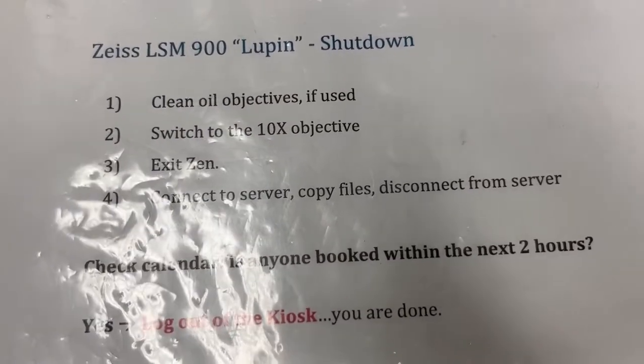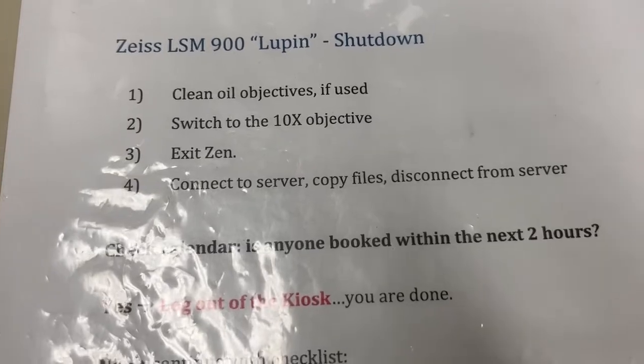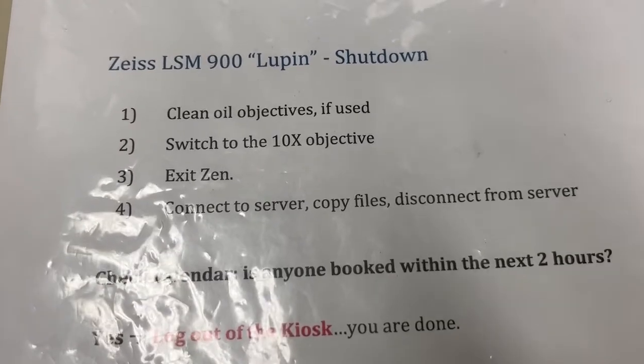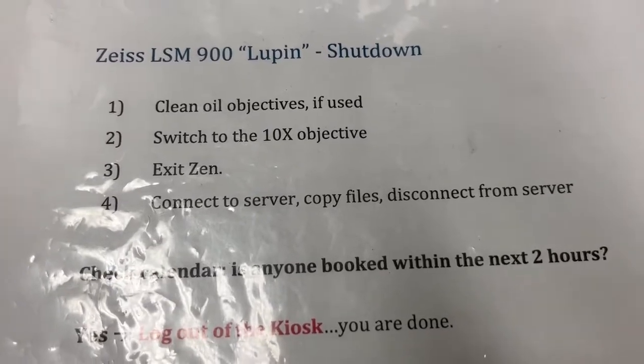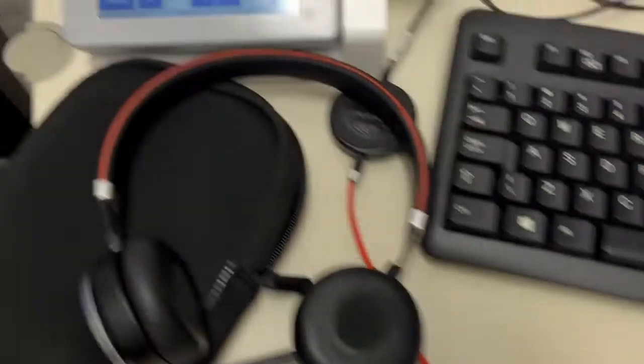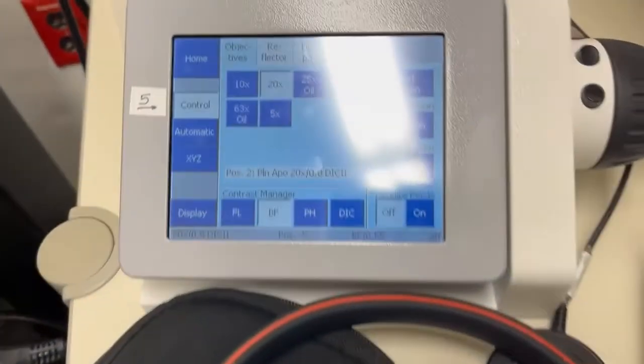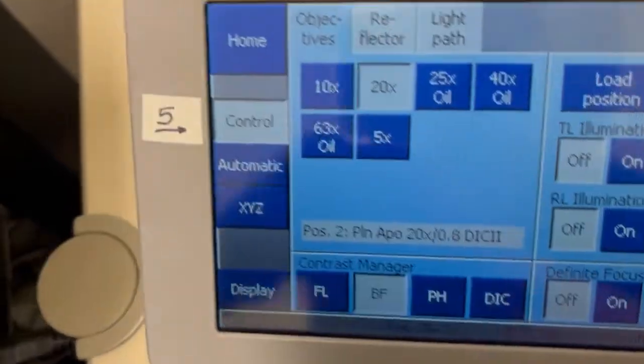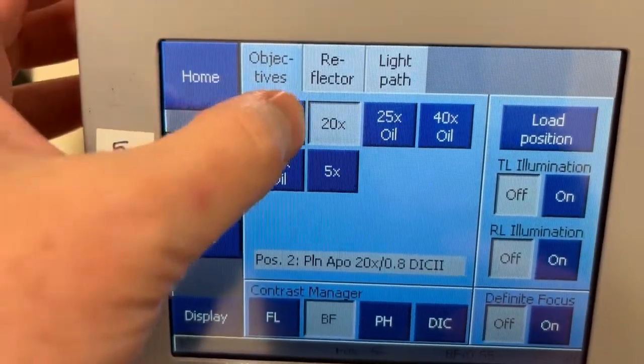The next step is to switch to the 10x objective. We always want to leave the system on the 10x objective so we do that here through this touchscreen. I'm going to go to 10x.